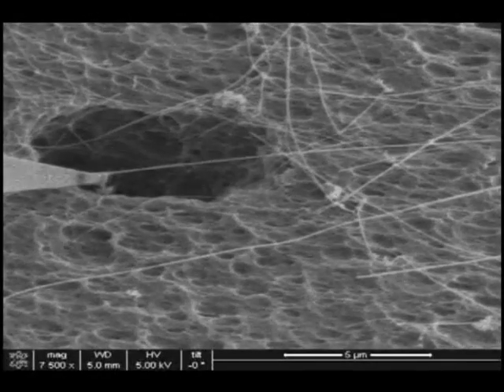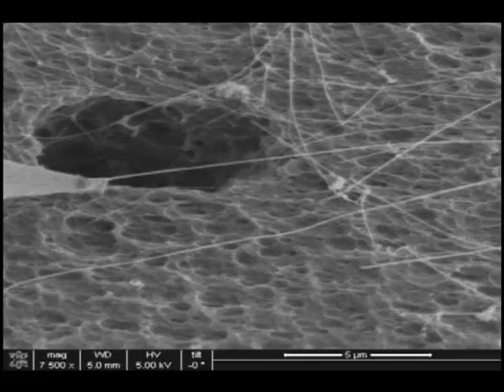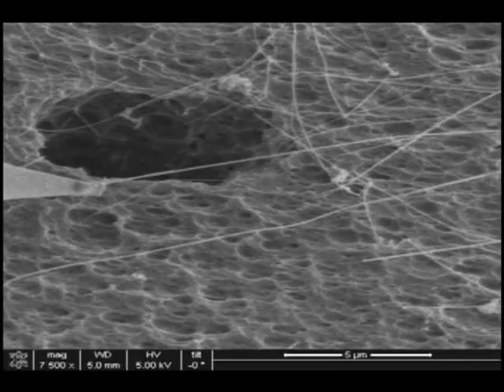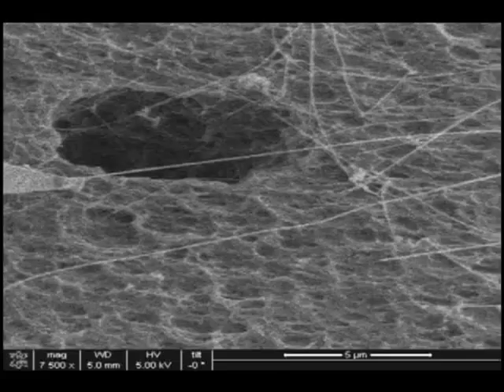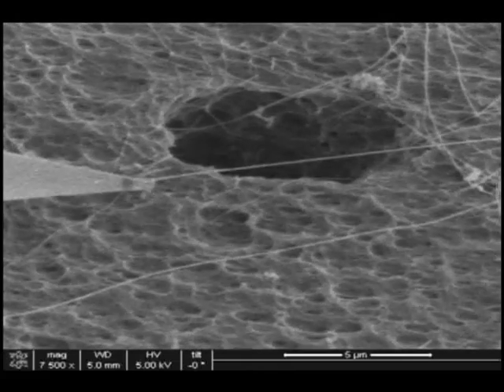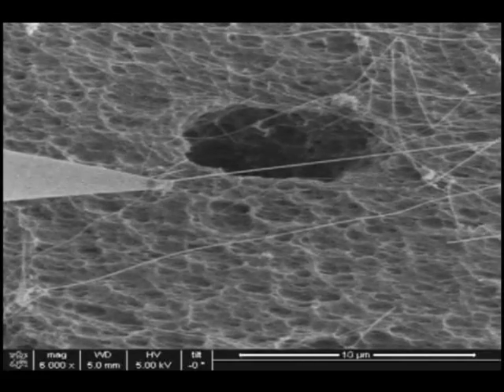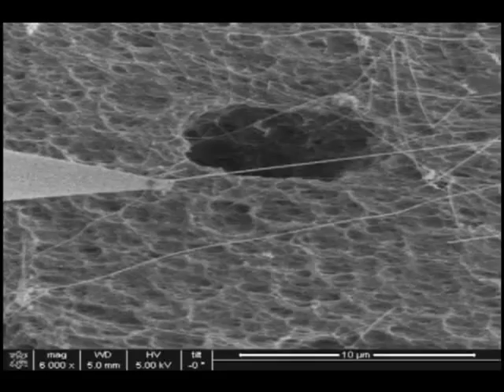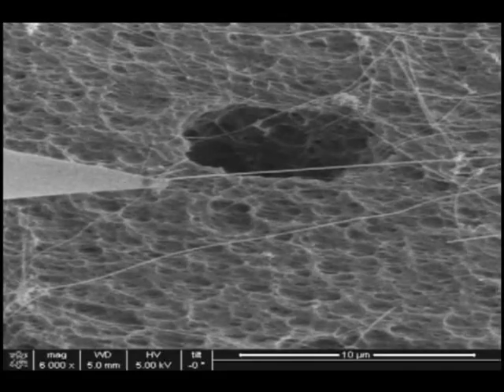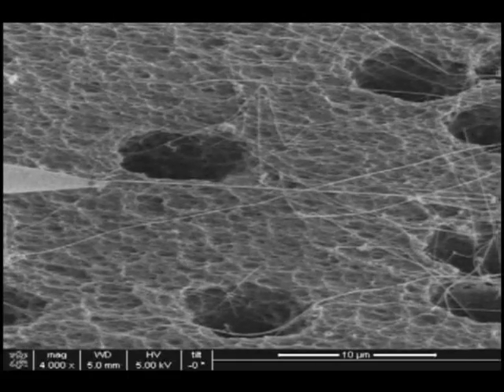The AutoProbe series of nano manipulators offers industry-leading performance for tasks such as TEM sample preparation via the in situ lift out method and manipulation of nano scale objects. Even in the nano world, navigation between two points is best accomplished by a straight line. The AutoProbe is the only nano manipulator that offers linear movement in any direction without backlash or vibration.